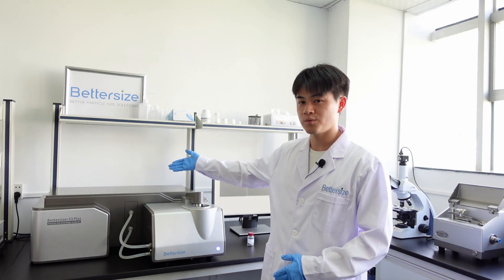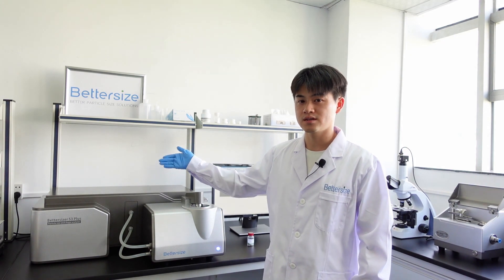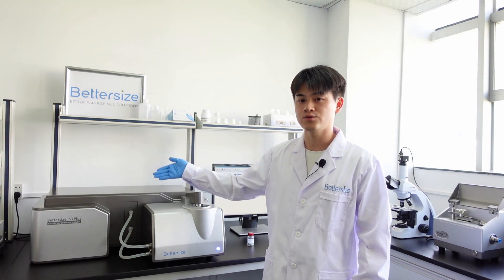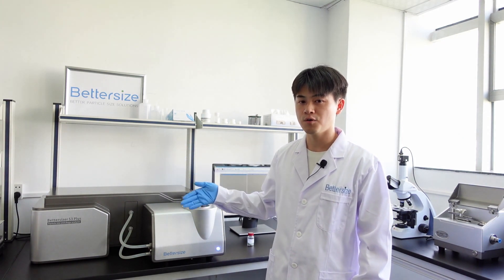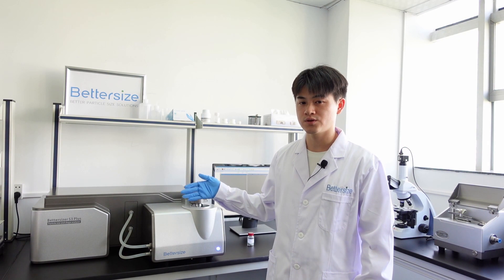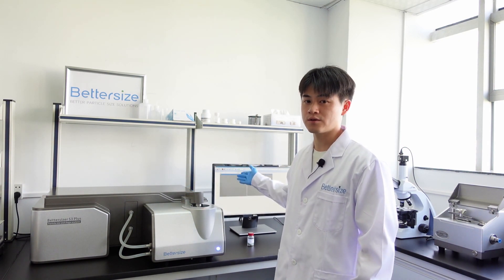How does the Bettersizer S3 Plus work? This instrument includes a laser diffraction system, an image analysis system, an automatic dispersion system, and specialized software.